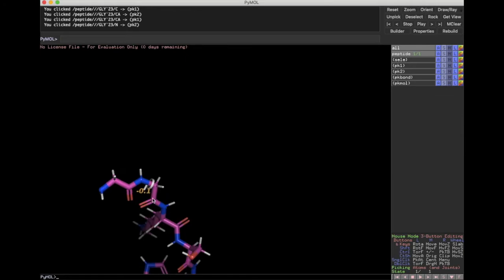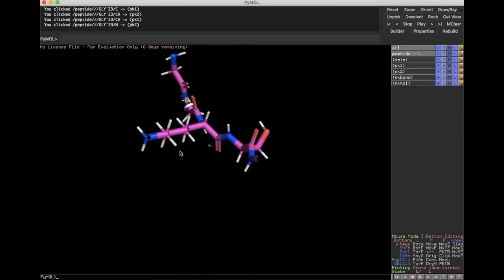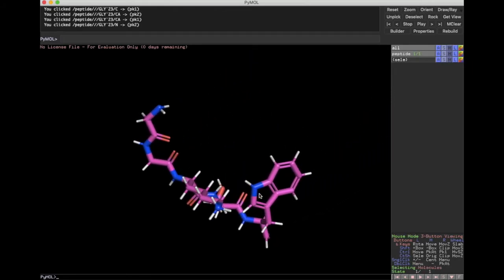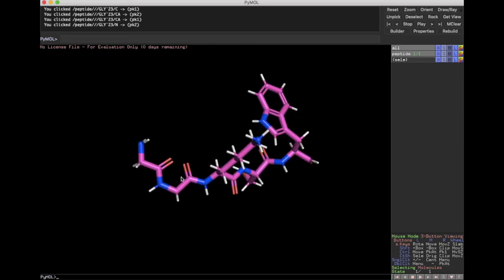All right, so now we got a phi and a psi angle that are both zeros, and look what we can see here. So I'm just gonna go back to viewing, slide this over. Look at this angle. We've got two oxygens, which are very negatively charged, which are now almost touching one another, all right? And so there is a lot of repulsion happening here. Without a doubt. And so I'm also going to, let's look at the van der Waals spheres of these oxygen atoms, okay? So again, the van der Waals sphere is kind of the outside of those atoms. That's kind of how far the electron orbitals will go.